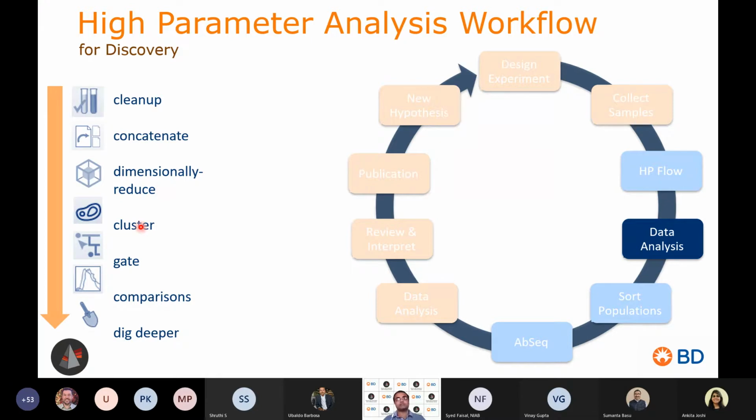In traditional flow cytometry, we make all those 2-dimensional plots and try to get some clusters. We make populations, we call them population A, B. That is pretty similar to the clustering we do here. Cells which have a similar phenotype come close together and form a cluster. While doing all these steps, we also make some keywords. Keywords are basically metadata, which after the clustering analysis is done, we can use to gate apart the different conditions we created and compare how they change across different experimental conditions. And if you're interested to dig deeper, then you have these sorted populations.